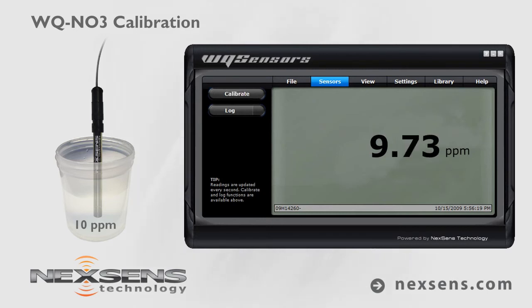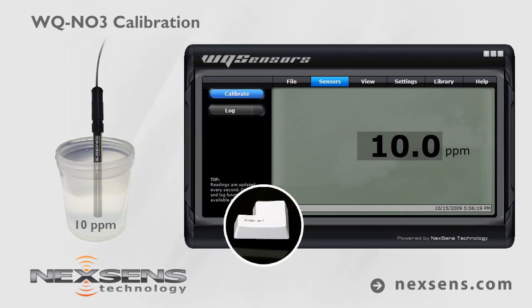Allow the reading to stabilize and press the calibrate button. Adjust the value to 10 parts per million and press enter.